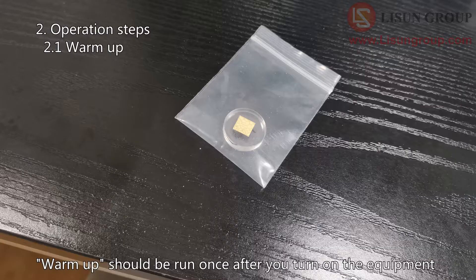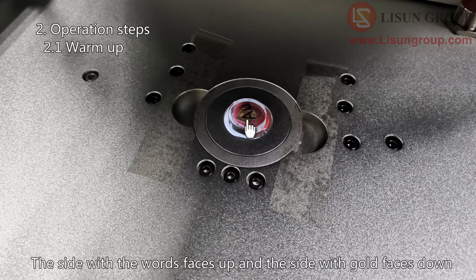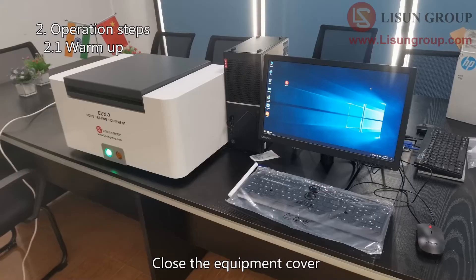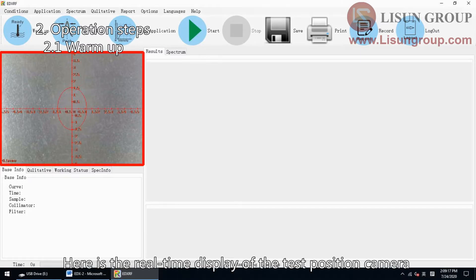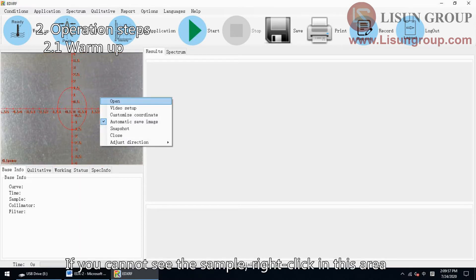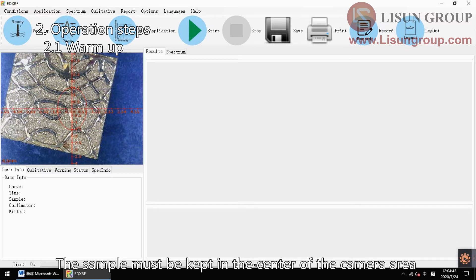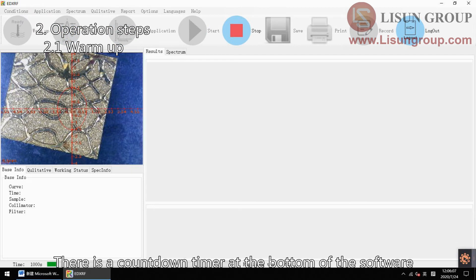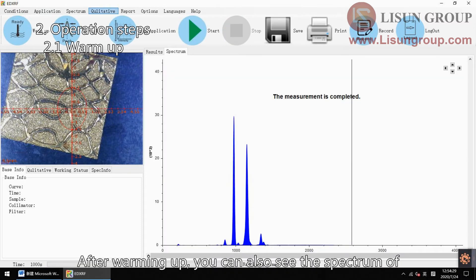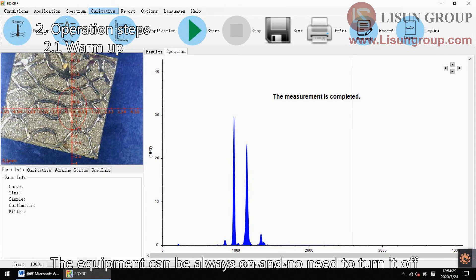Warm up should be run once after you turn on the equipment. Put the gold to the equipment test position. Pay attention to the direction of the gold — the side with the words faces up and the side with gold faces down. Close the equipment cover and double click to open the software. Here is the real-time display of the test position camera. If you cannot see the sample, right click in this area and click open to refresh the camera. The sample must be kept in the center of the camera area. Click warm up. The warm up time is 1000 seconds. There is a countdown timer at the bottom of the software. After warming up, you can also see the spectrum of the gold by clicking spectrum. The equipment can always be left on with no need to turn it off. If the equipment is turned off, you need to run warm up again after the next power on.